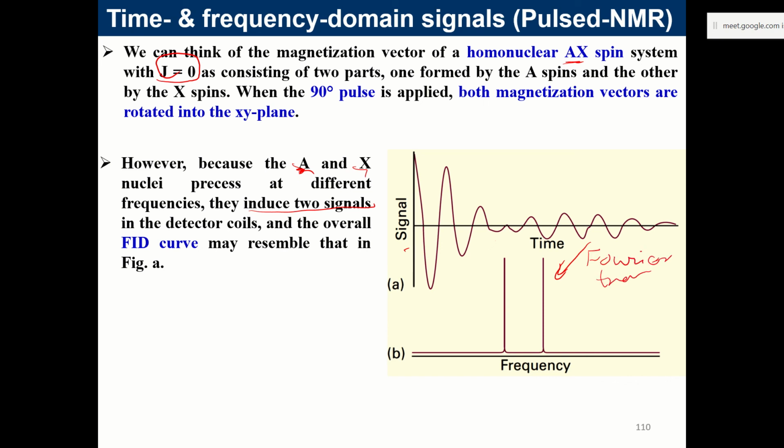Fourier transformation. Signal versus time was a time domain thing, and now you are getting a signal in frequency.